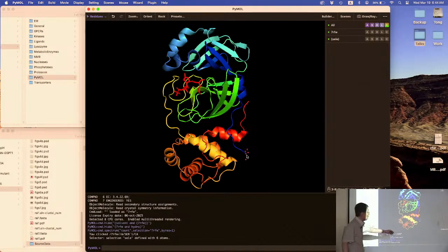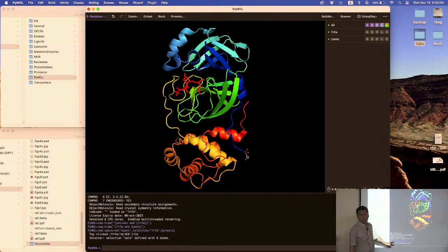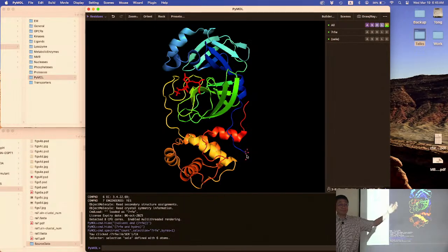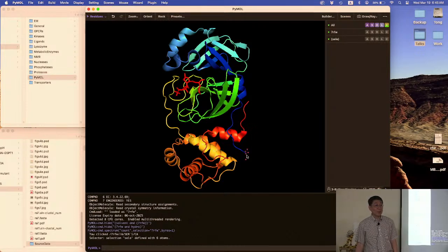You mean just click on here, right? It should show up, it should echo what you did down here in your command line, command window. And then it tells you which one you clicked. Do you see that? You got it?